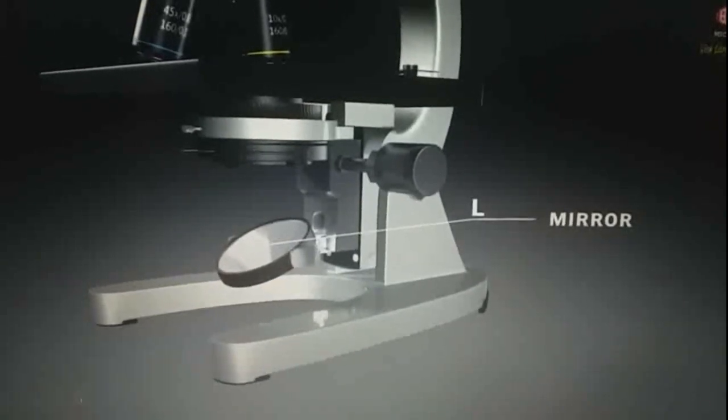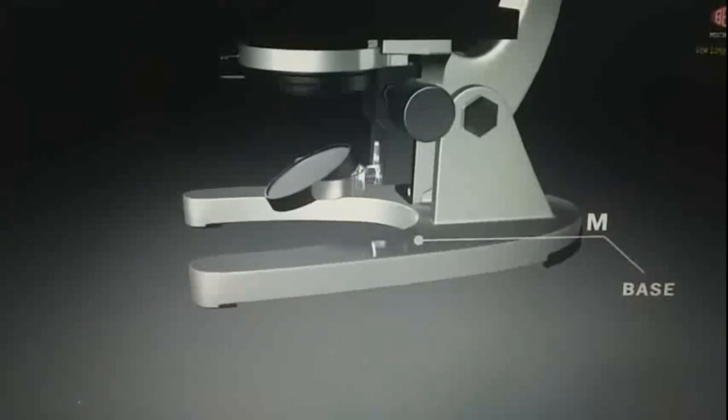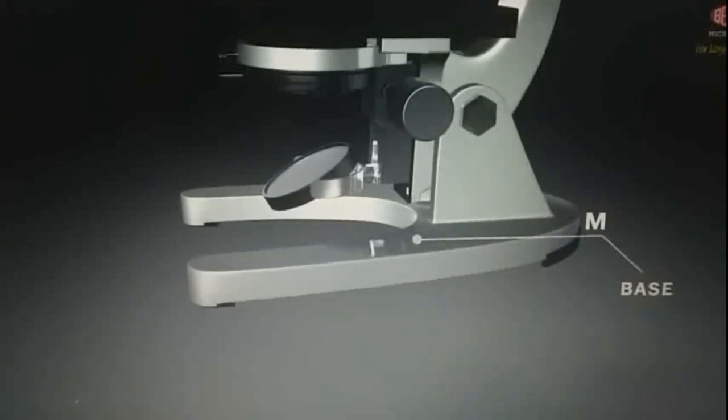L, mirror. It increases the amount of light shining through your slide or sample. M, base. It is the heavy bottom part which supports all the other parts of microscope.